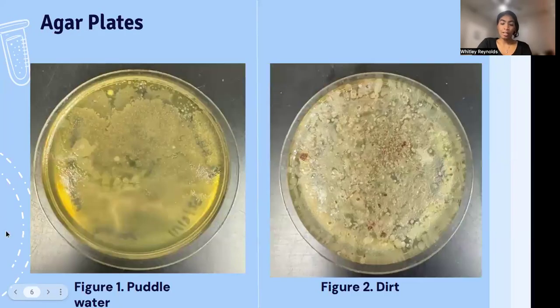You can see the agar plates used in the experiment. The first plate shows noticeably more bacterial colonies compared to the second. This visual comparison highlights the effect of the independent variable, whether that is temperature, moisture, or another factor that was tested. The difference between the plates demonstrated how even small environmental changes can drastically change colony formation.